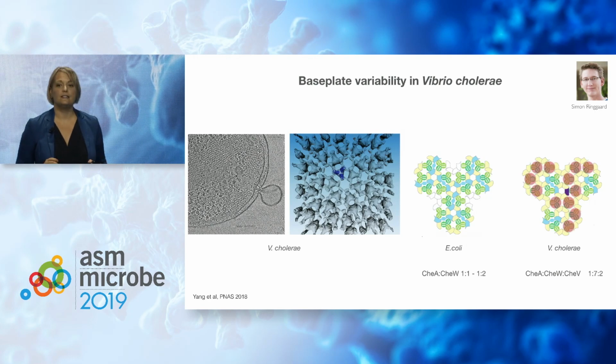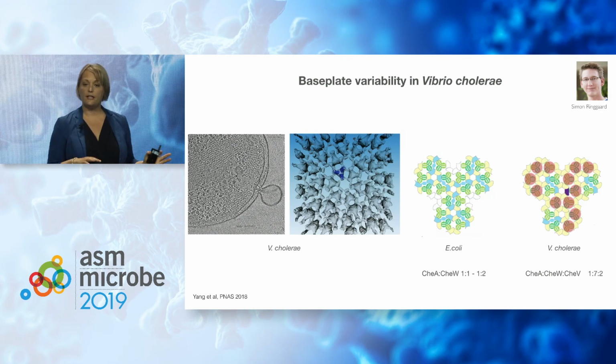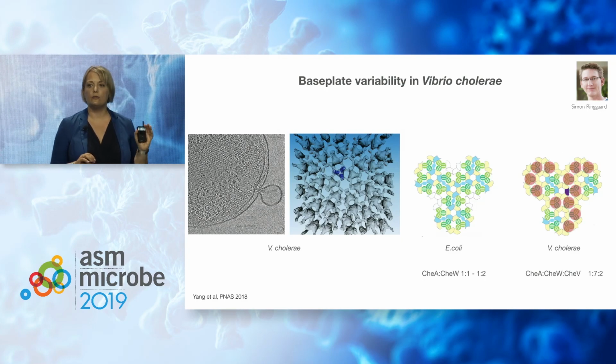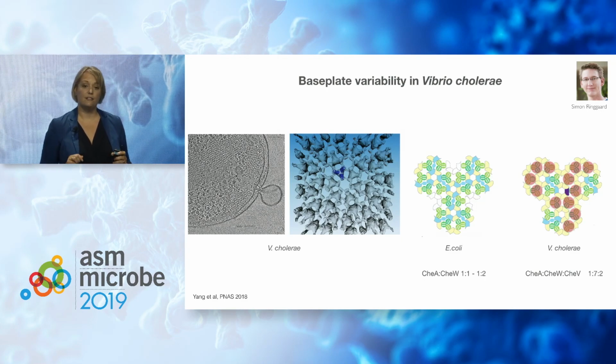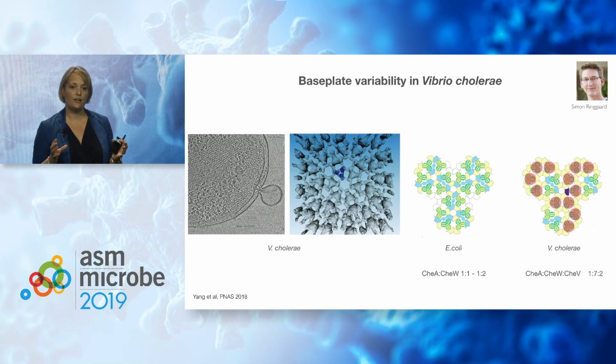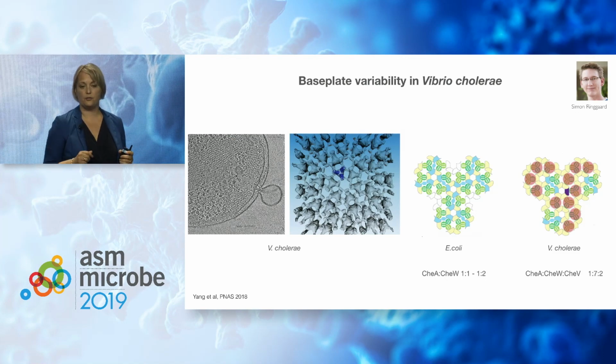So you see these labeled receptor trimers in red. If you look at E. coli, each trimer actually connects to a kinase, whereas in Vibrio, all of these red ones are not in direct contact with a kinase. So we need this ordered packing and this tight regulated packing to allow these receptors to transmit the signal through the array to activate a kinase.